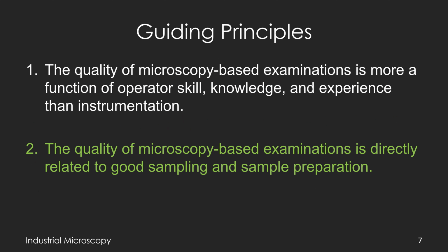That being said, the guiding principles of all of my work, as well as what I've taught, are really two. The first is the quality of the work is directly dependent on your skill as a microscopist. And the second is the quality is directly related to how well you can sample and the quality of the sample that you're able to produce. And so, in order to really gain this kind of experience, I'm hoping that these videos will give you a bit of a shortcut to say, well, here are some of the tricks of the trade that will help you to solve some of those problems and gain experience.